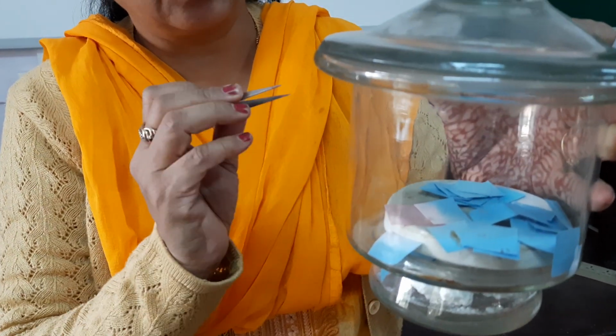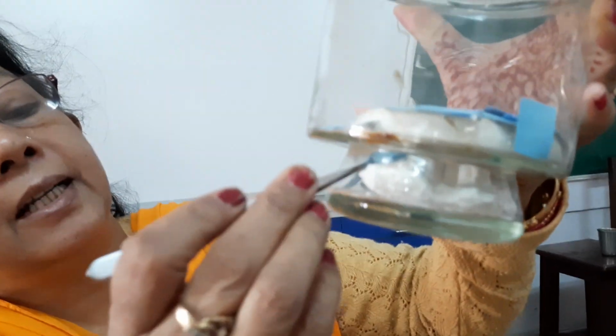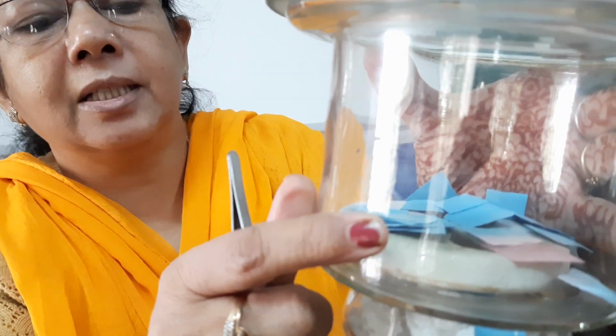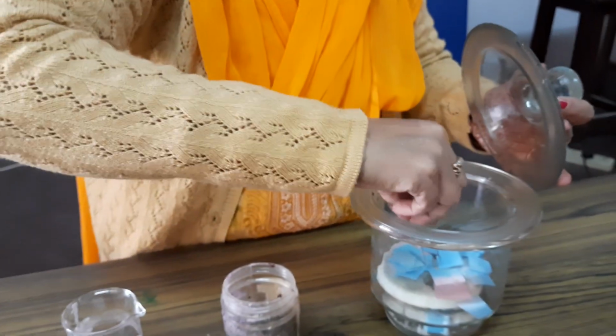It has got holes on this. Now at the base of this, you can see these white colored pieces, clumps of calcium chloride. Anhydrous calcium chloride is actually used for absorption of moisture. So whatever air is present in the desiccator, from that also moisture is absorbed, and the cobalt chloride paper, pink colored one, which I keep here, right?